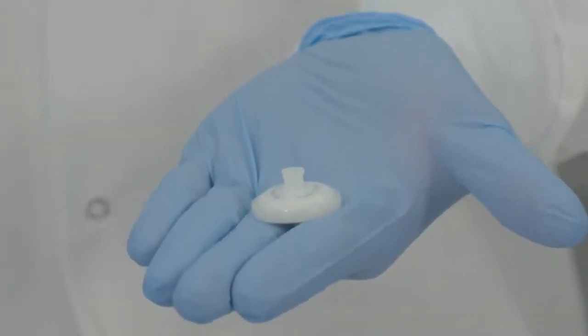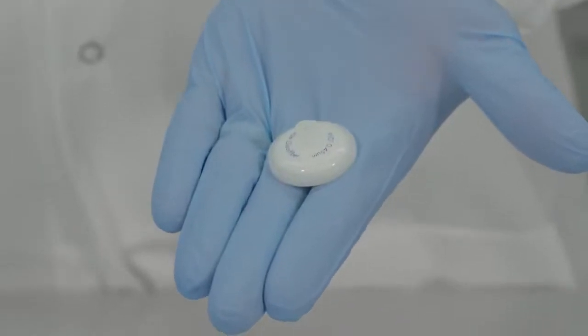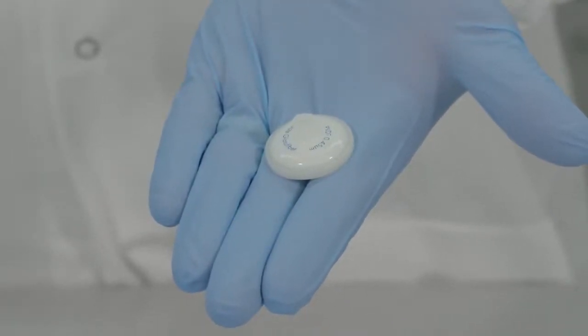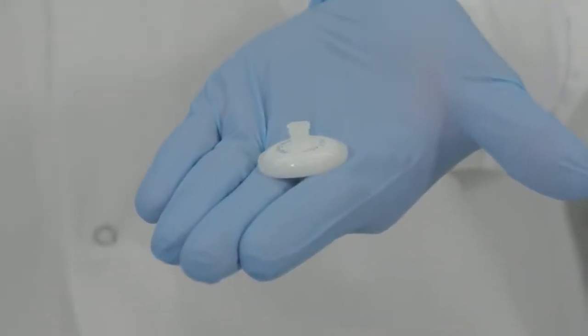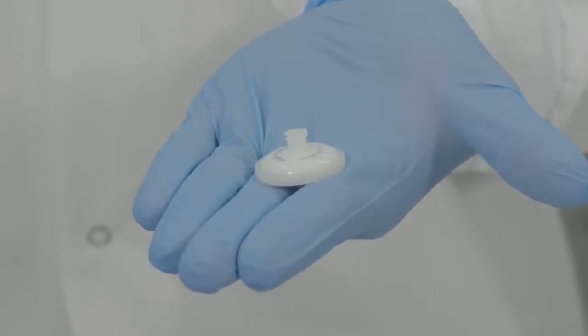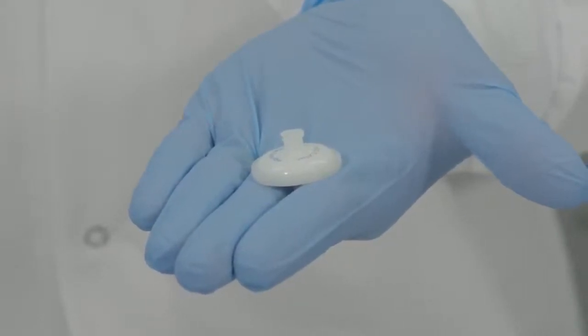For 25mm HPF syringe filter, the filter is asymmetric with a layer of pre-filter that is glass fiber and the final membrane. Sample needs to be filtered through the pre-filter followed by the membrane.